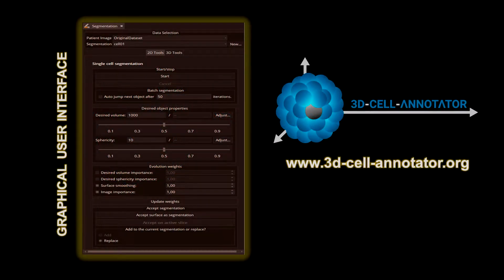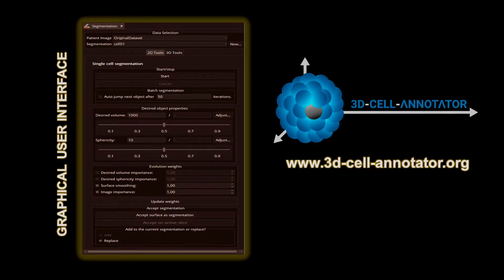3D Cell Annotator is a freely available software tool for segmenting single cells and nuclei starting from a 3D dataset. It uses active contours with shape descriptors as prior information for true single cell annotation in a fully and semi-automatic fashion. It is implemented in C++ and CUDA, and distributed as a patch for the segmentation module of the Medical Imaging Interaction Toolkit. It works on Linux and Windows 64-bit operating systems and requires a recent version of the NVIDIA drivers and a CUDA-enabled GPU.